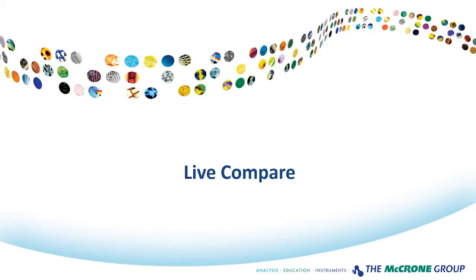Live Compare enables easy image comparison between a sample image and a live image. Live observation side by side with a paused live image is also available in a split screen mode.